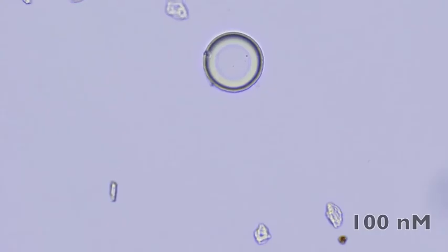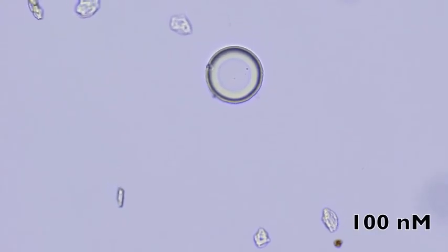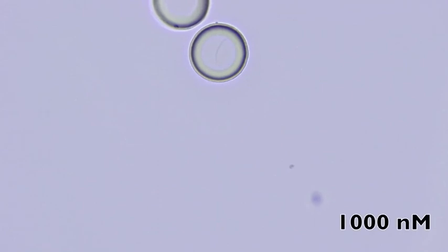The samples can then be inspected using bright field and fluorescence microscopy with the Olympus BX51 microscope. Using standard green filter set UN31001 and the DP10 microscope digital camera, the following images were all taken.